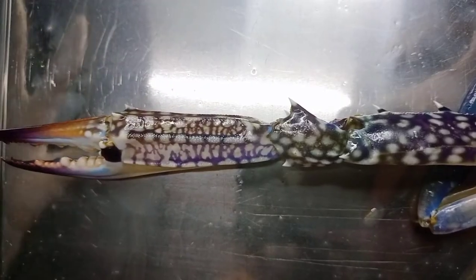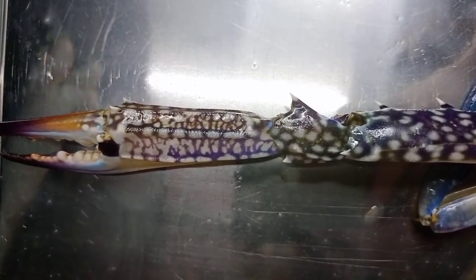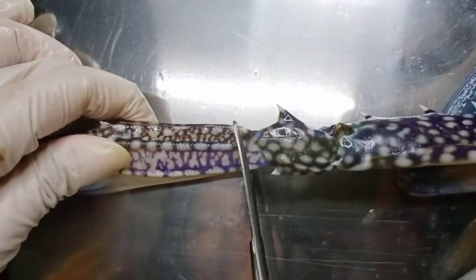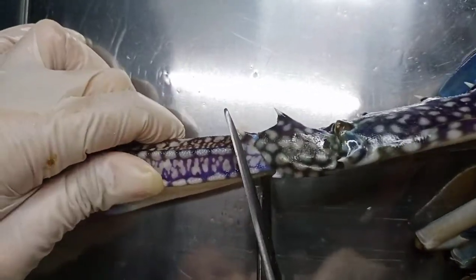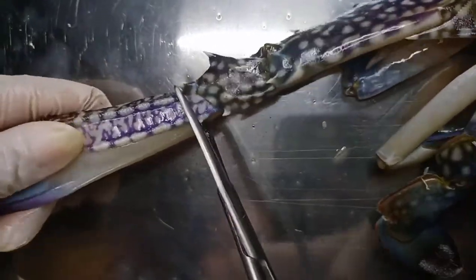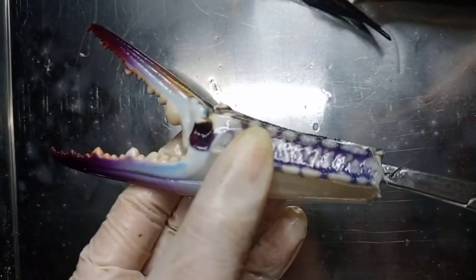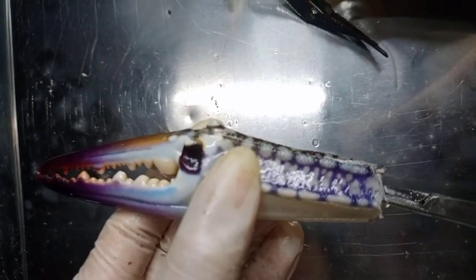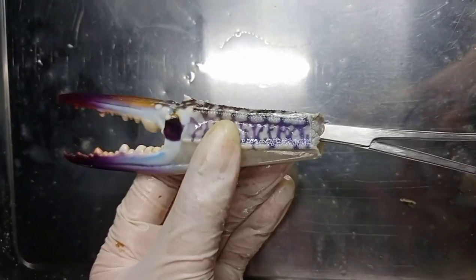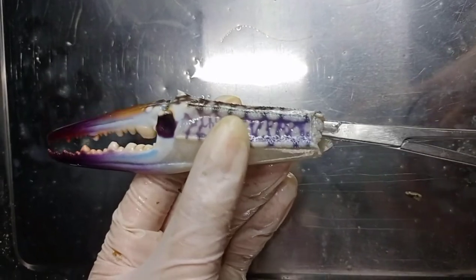As I said earlier, we will dissect the pincers to see the muscle contractions occurring here. When we pull it down, the claw will close. And when we push it up, the claw will open. That's it. Don't forget to clean your area and wash your hands and your tools. That's all for the crab dissection — I hope you learned something. Thank you.